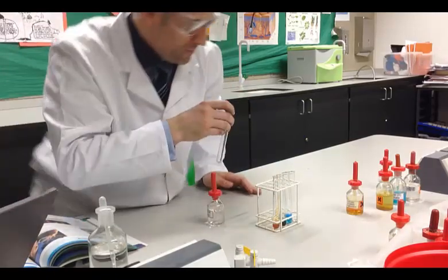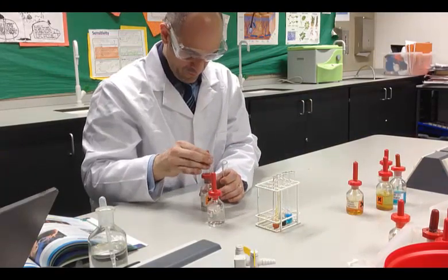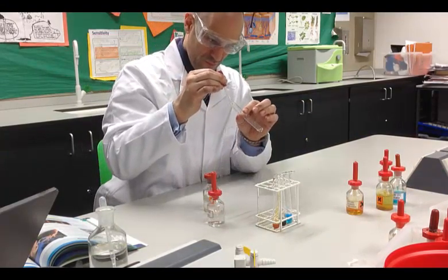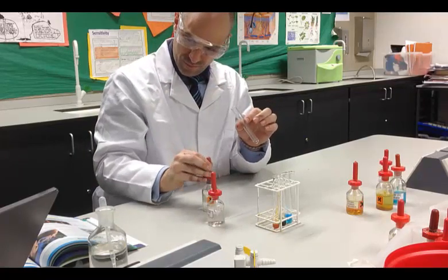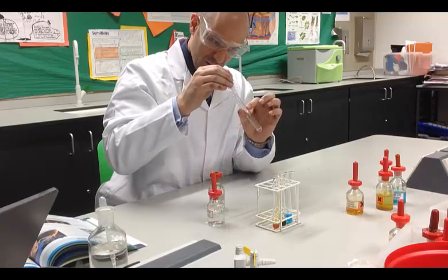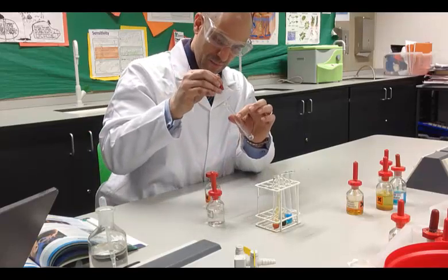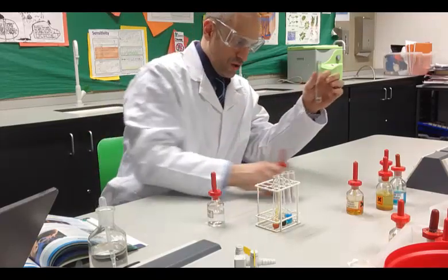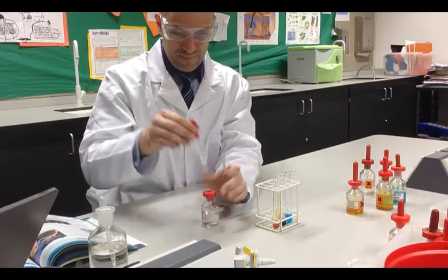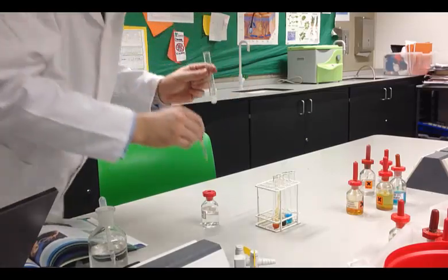Finally, I move to calcium. Samples of this. Now I want to show you something special with calcium. Calcium, you see, also forms a white precipitate. Okay, here we go. See that? Wonderful white precipitate. However, let's have a look at the chemistry of the sodium hydroxide test for cations.